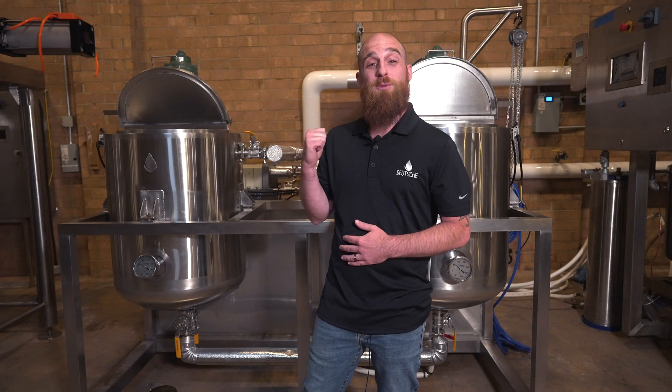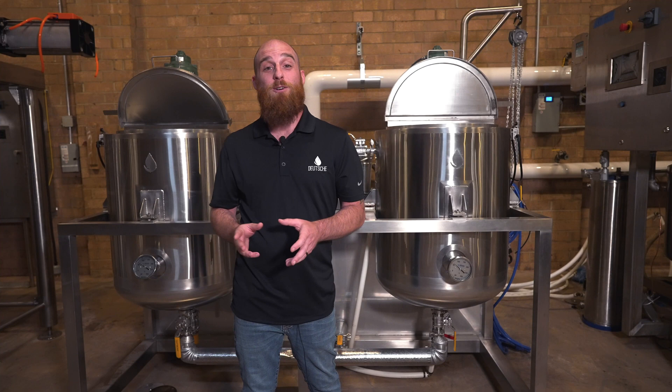Summer is here and in full effect and to give everybody a little bit of a break from the heat, what we're going to be talking about today is our Deutsche Process winterization system. Winterization is a vital step to any type of botanical purification and has a lot of different benefits.